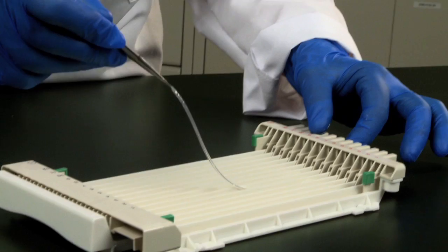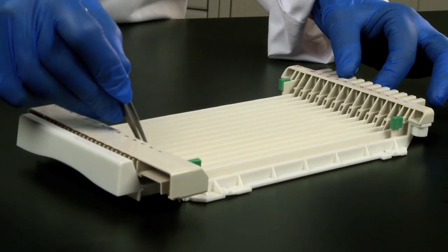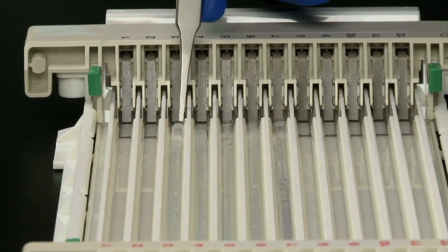Place the rehydrated IPG strip gel side down on top of the electrodes or on top of the wicks if you've chosen to use them.